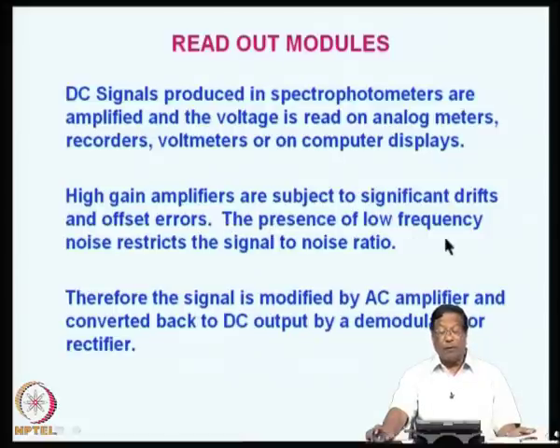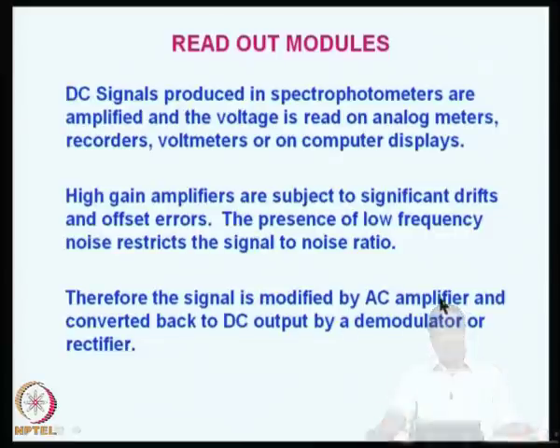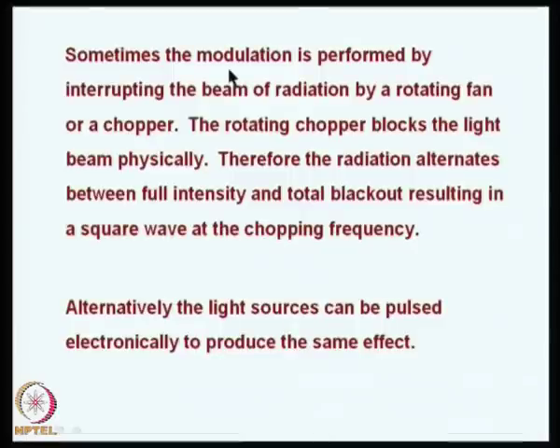Now, the presence of lower frequency noise restricts the signal to noise ratio. This is one of the biggest problems in spectrophotometry, because you have to measure the difference between the noise as well as the signal. Therefore, the signal has to be modified by an AC amplifier and converted back to DC output by a demodulator or a rectifier. Sometimes the modulation is performed by interrupting the beam of radiation by a rotating fan or a chopper.